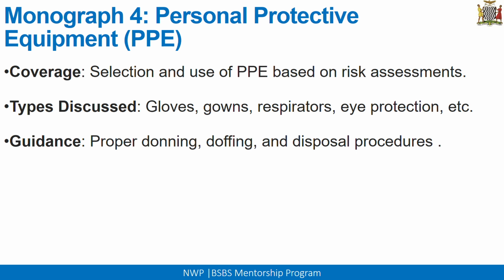So guidance. I've already mentioned proper doffing and donning of the different types of PPE, and then most importantly, how you dispose of this PPE. For the different types of PPE, you may have different methods or procedures by which you're supposed to dispose of them. So it also gives you guidance on how to dispose of your PPE in an appropriate as well as safe manner, both security and safety wise.